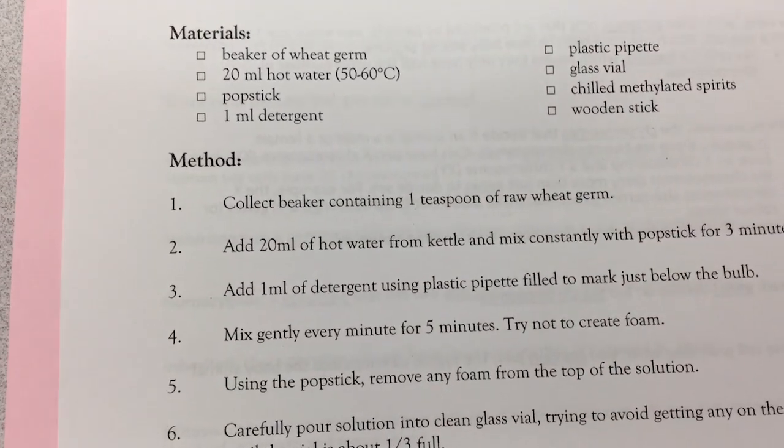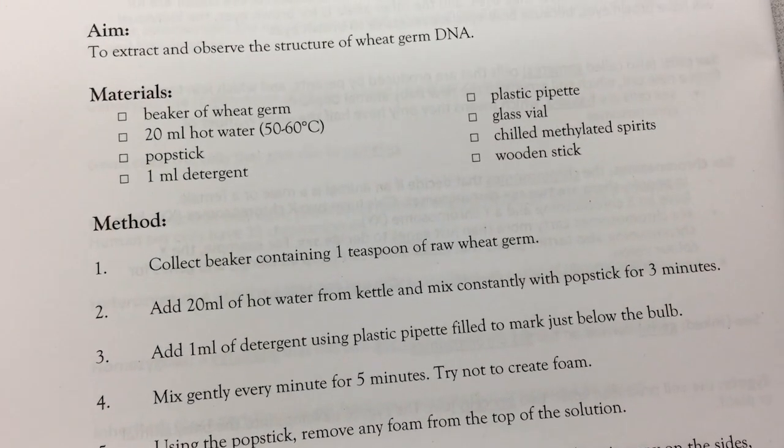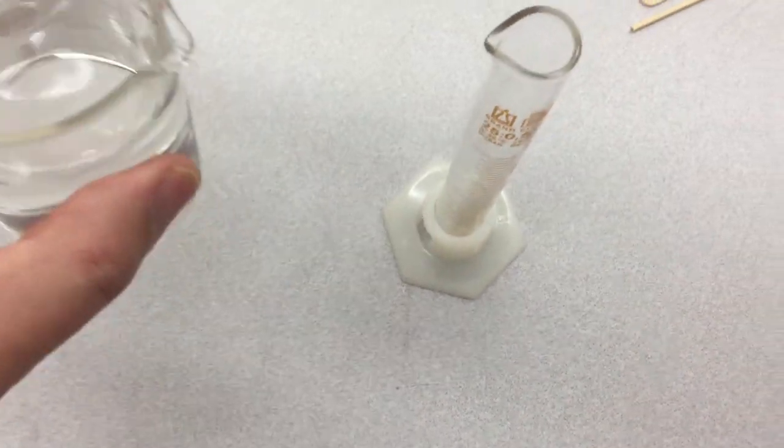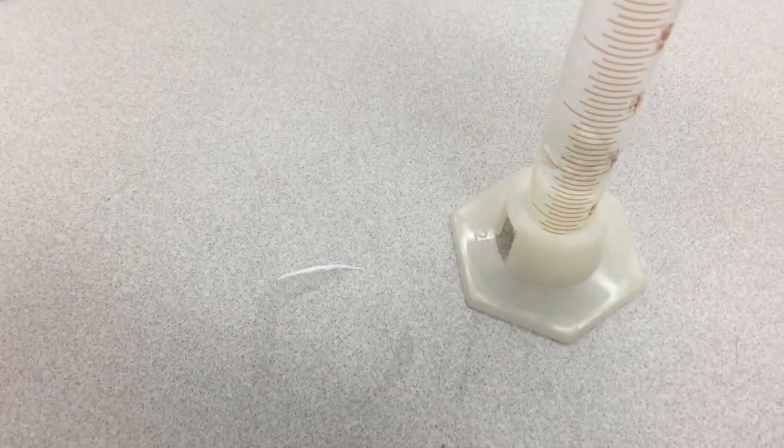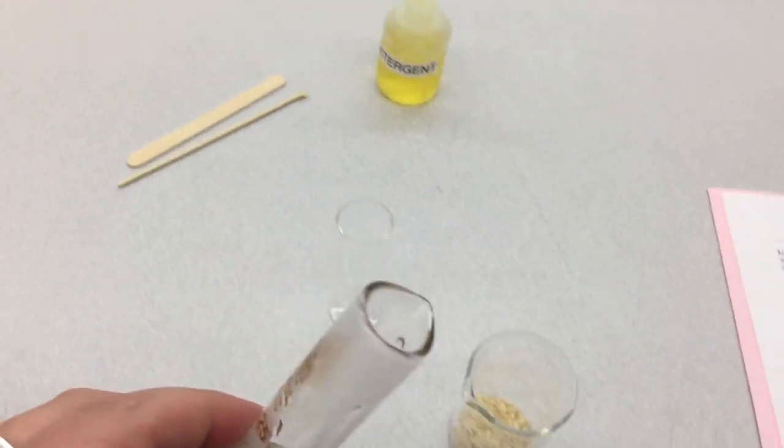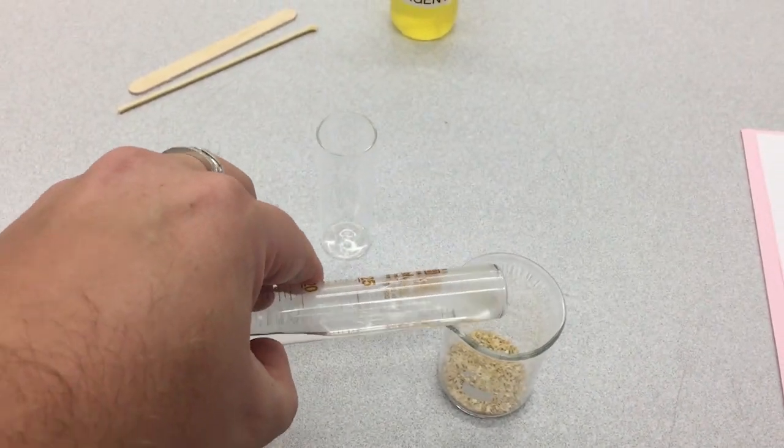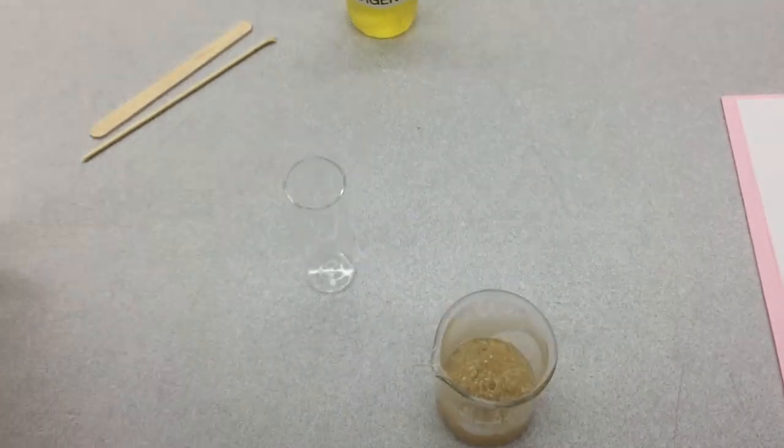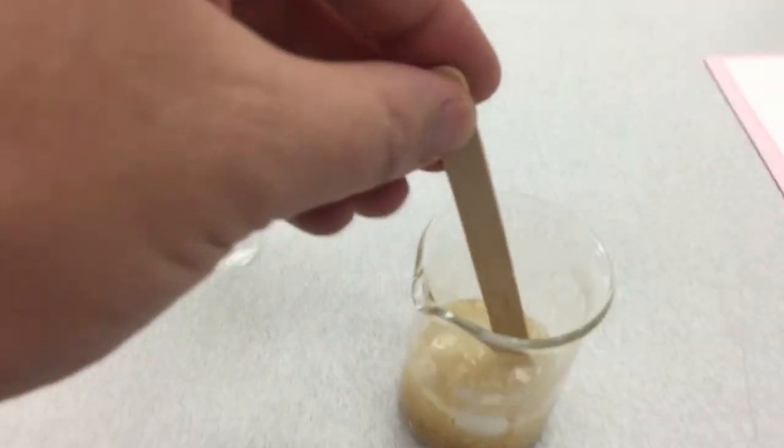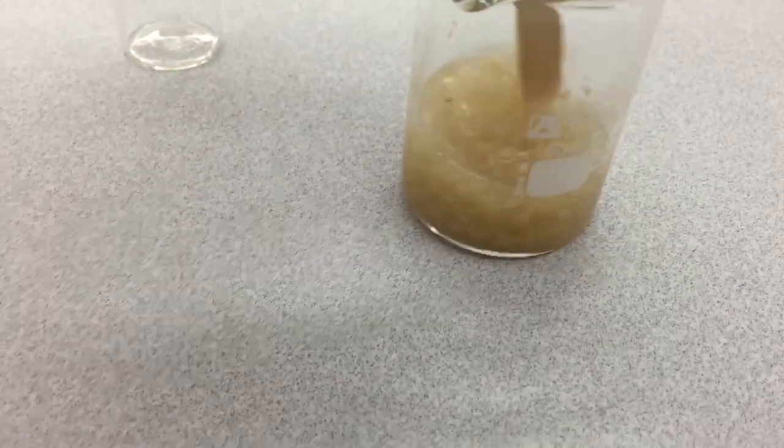Step 1 is to take our beaker with 1 teaspoon of raw wheat germ, and to add 20 mils of hot water from the kettle, and mix constantly with popstick for 3 minutes. So I have a beaker rather than the kettle here. And I'll add this to our beaker of wheat germ, and I'm going to take a popsicle stick and mix quite vigorously for about 3 minutes.